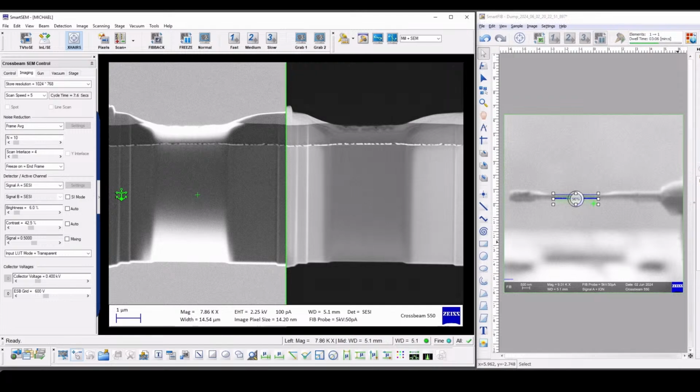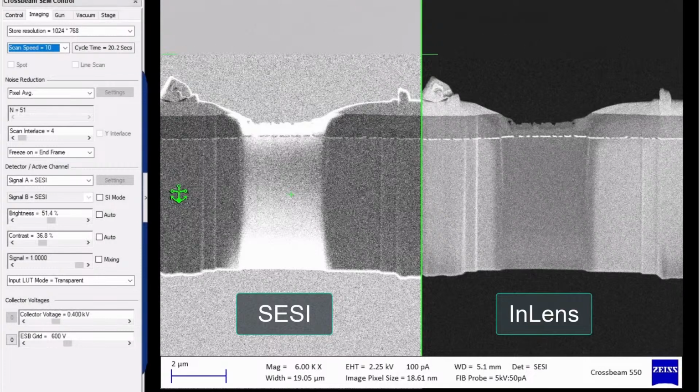And you can see where the very top of the lamella and the very bottom of the lamella thin quite a bit faster than the other area. So if you wanted to target something in the middle of the lamella, then you're going to have to probably sacrifice something at the very bottom, and you have to keep track of how much protective layer you have left.